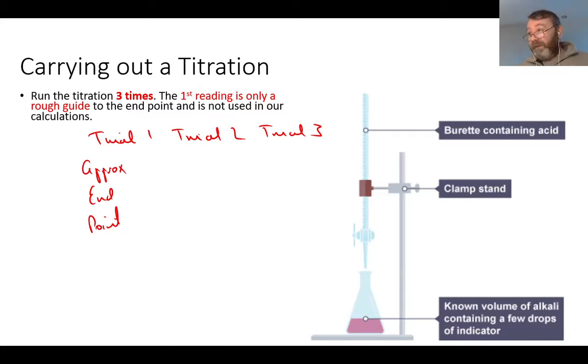So it's like the same thing as saying, you know, if you put 2 people into a bath or 2 people into a swimming pool, the concentration changes, but the number of people in both stays exactly the same. So if we put some moles of a chemical into a small amount of water, or the same number of moles into a large amount of water, it's the same number of moles. I need you to think about that. Okay, so we're free to wash the inside of the conical flask quite regularly, just to get all the reagents that stuck to the sides down to the bottom where they can react fully.